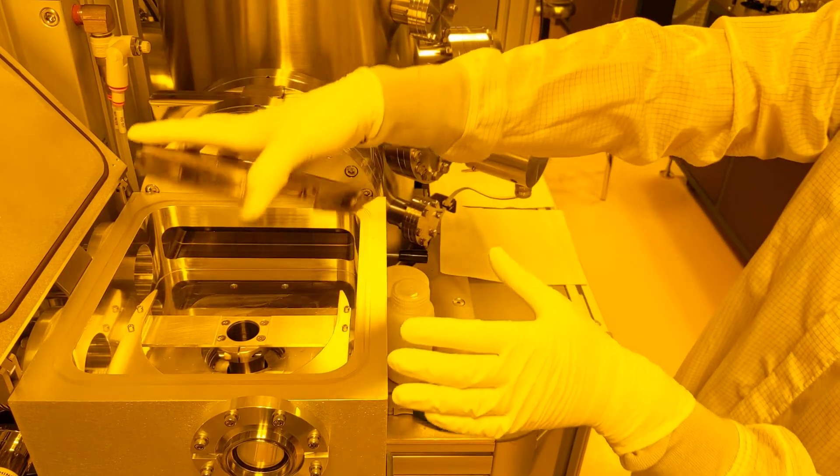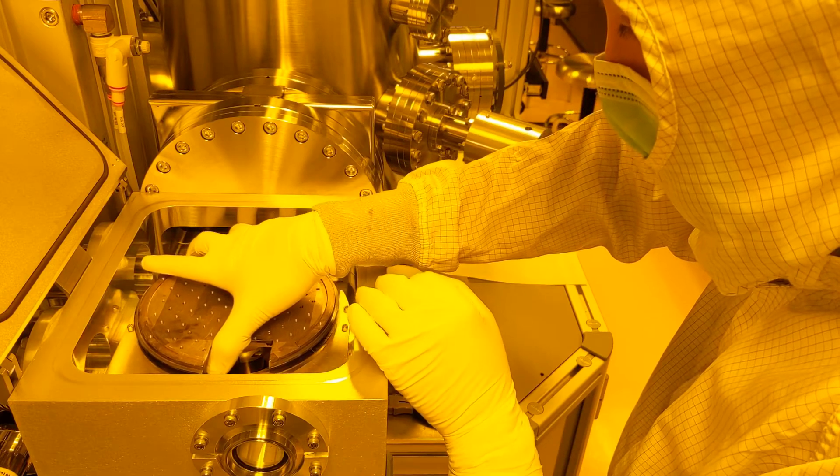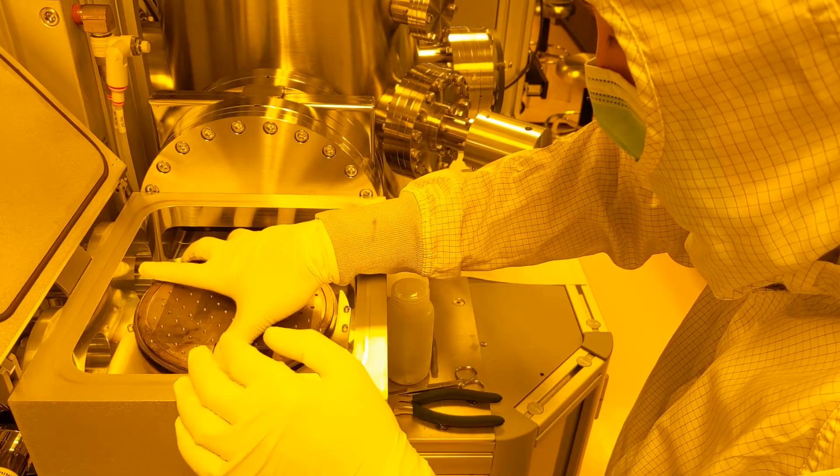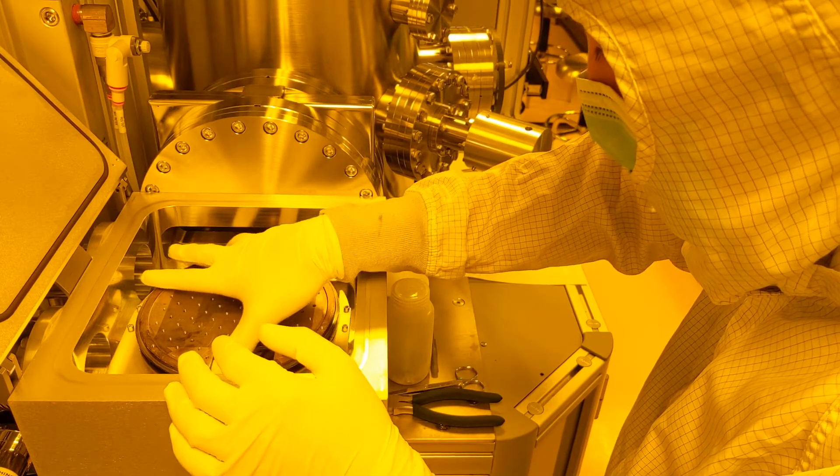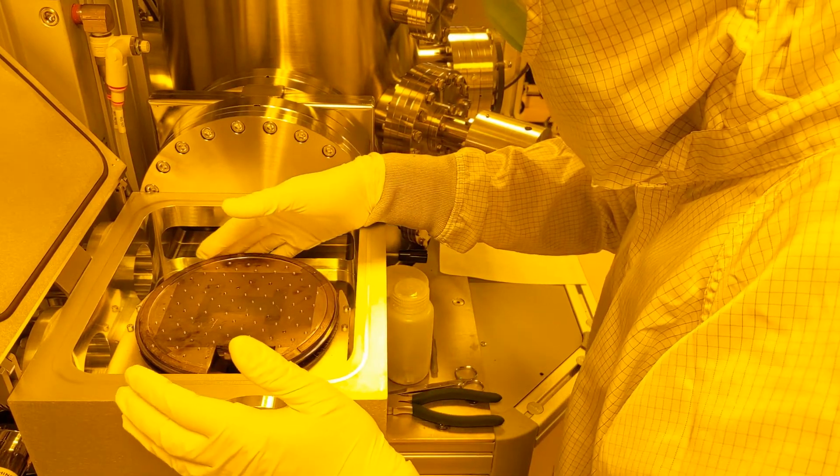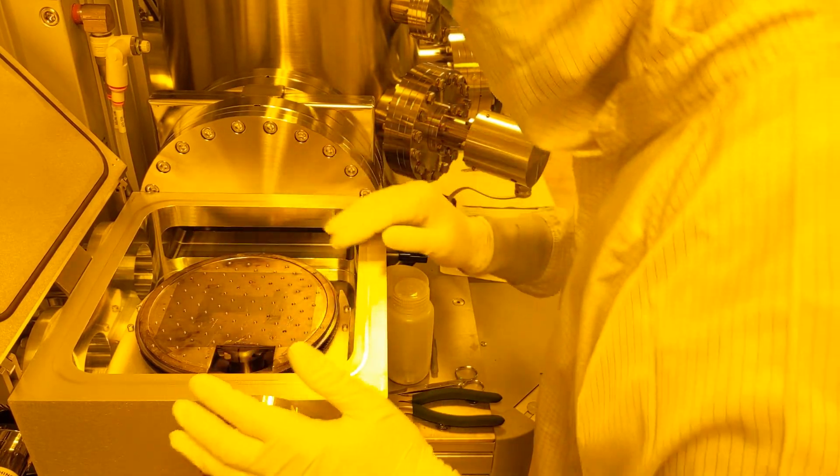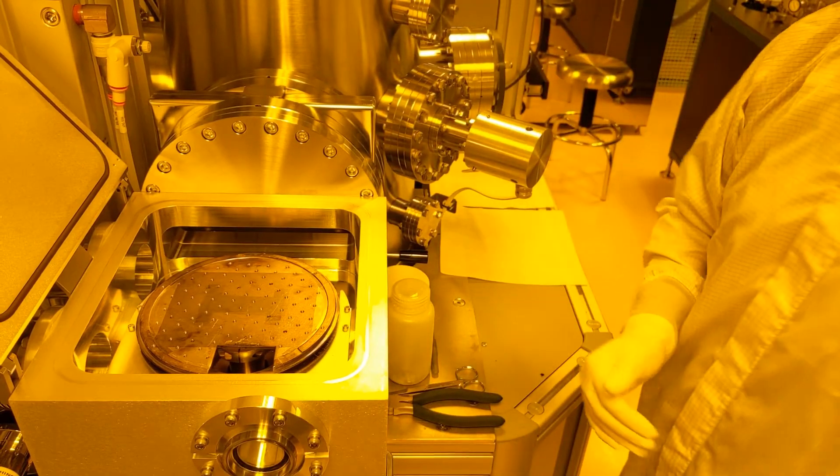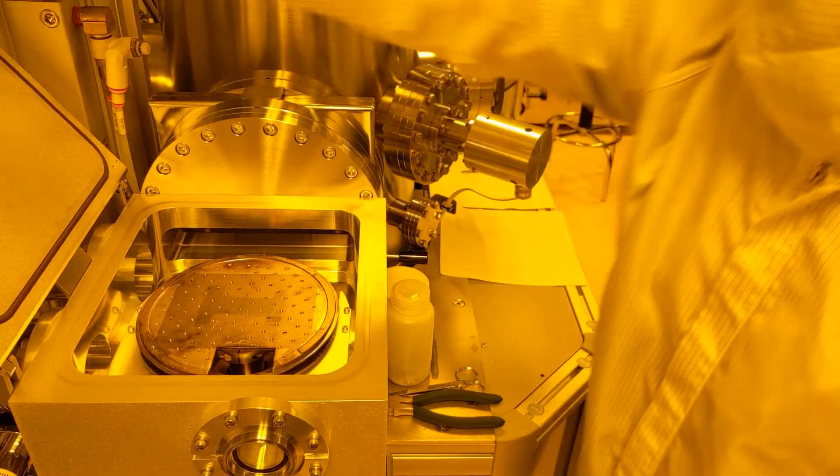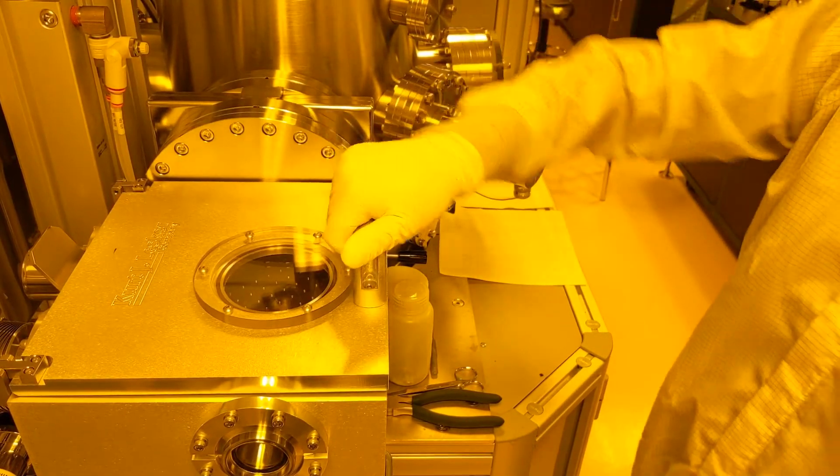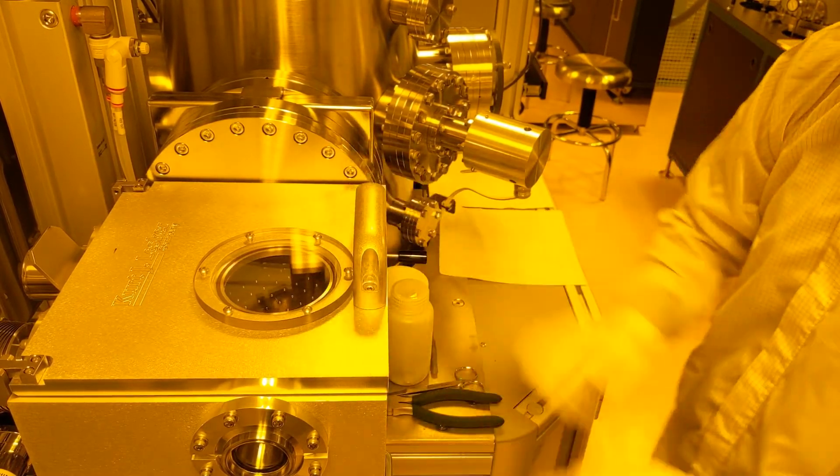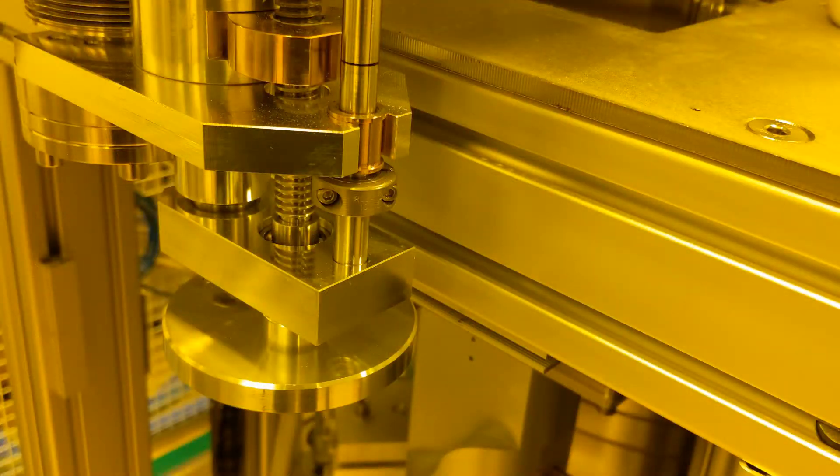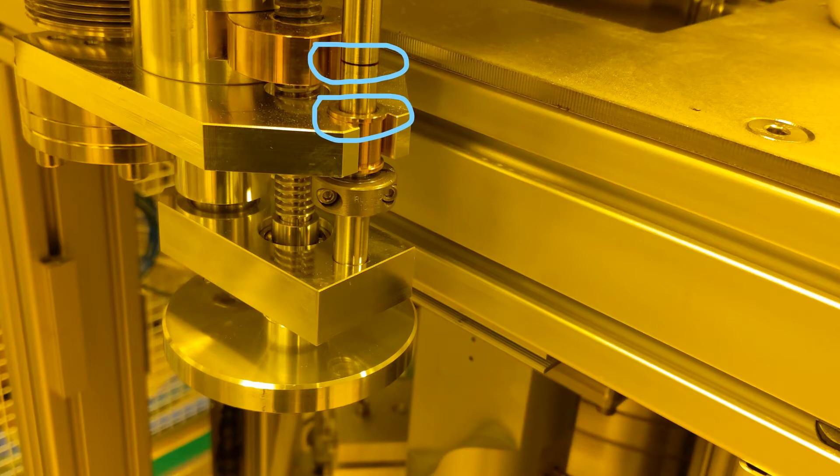Then initiate the load lock pump down process. While the load lock pumps down, set the platen stage to the proper height for transfer. This will ensure that the transfer arm grasps the platen in the right place. To do this, locate the height manipulator directly under the load lock. Notice the black ink line on the shaft. You want to crank the manipulator up until the top of this brass piece is at the black line.